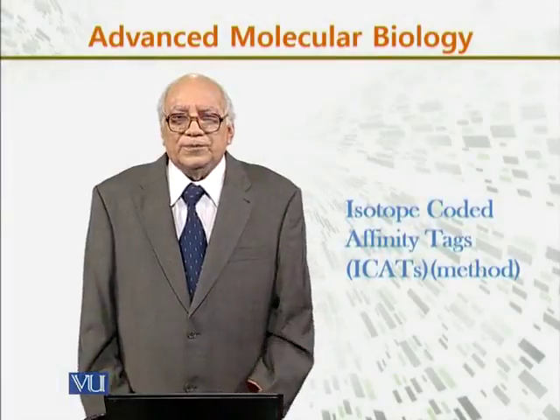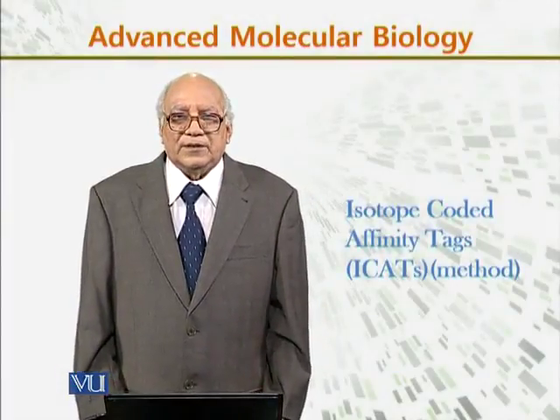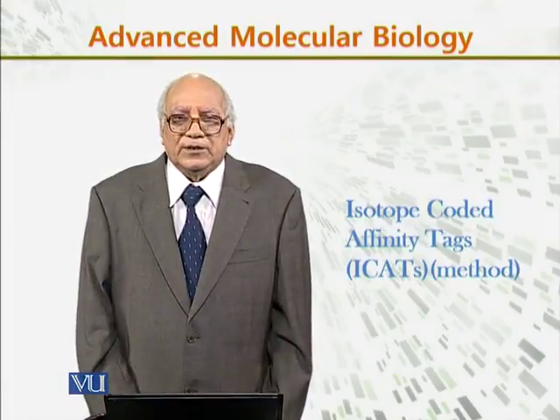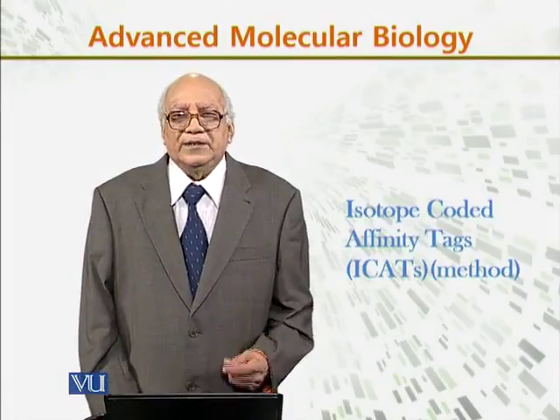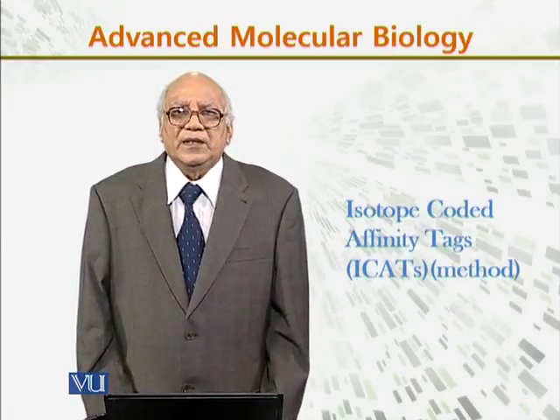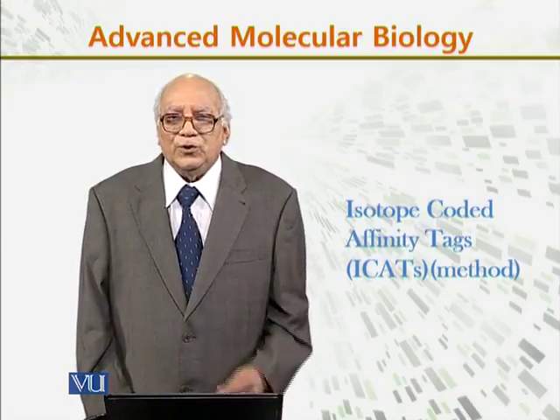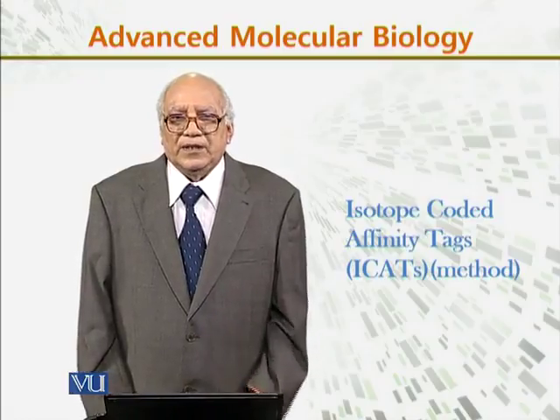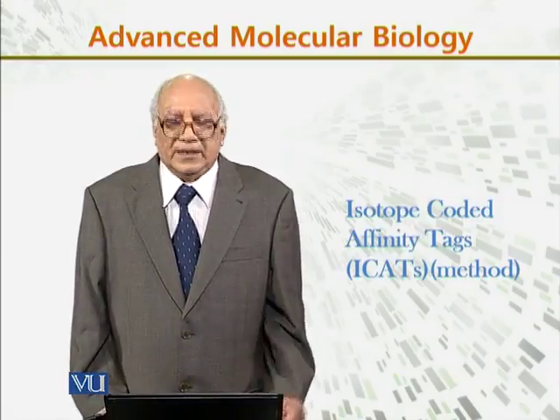In this module, we will discuss another important method to quantify the protein. And the method is isotope coded affinity tags, ICATs.